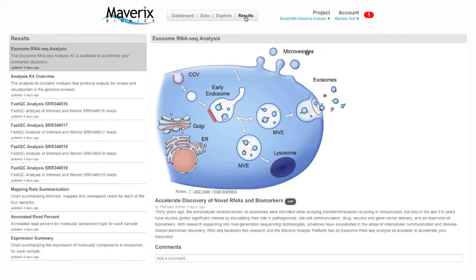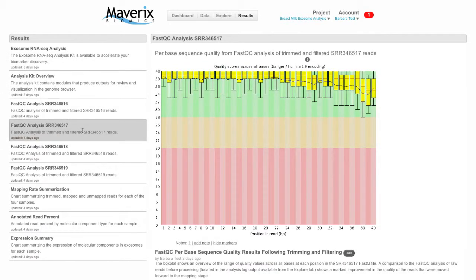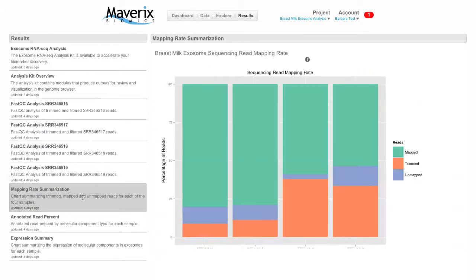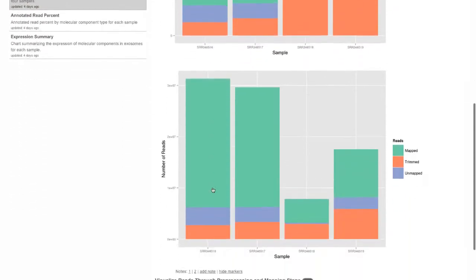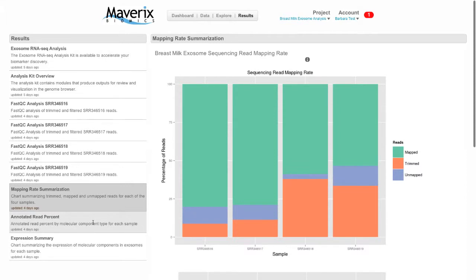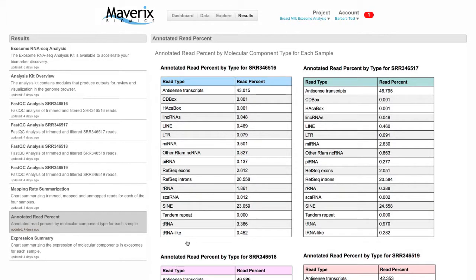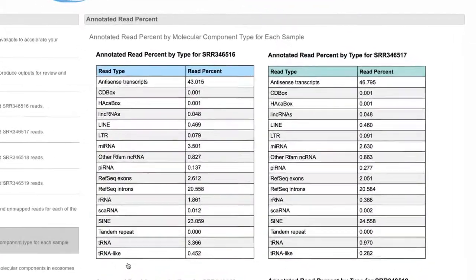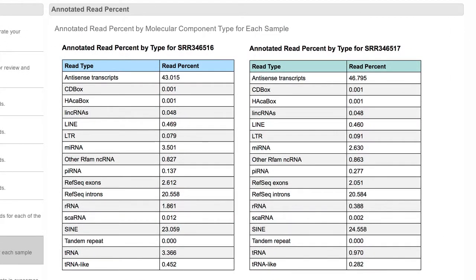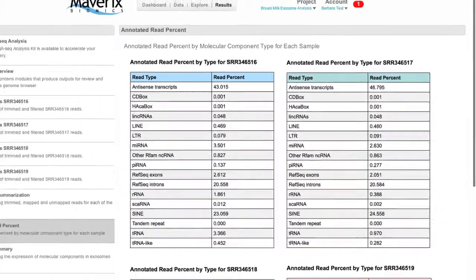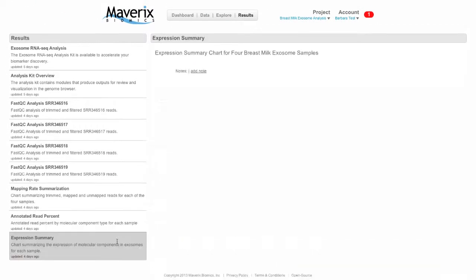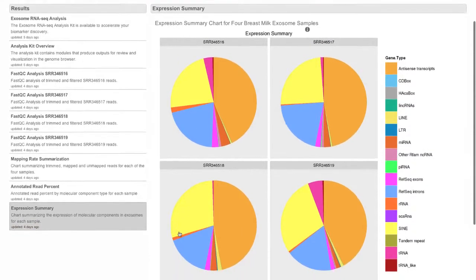Some of the highlighted output from the analysis kit will be promoted to the Results tab. Here we find the final QC analysis results that show the quality of the improved set of reads that were moved into the Bowtie mapping step of the analysis. Your highlighted results are also displayed in plots and bar charts that allow easy visualization and comparison between samples. Here is a tabular display of the expression results from our exosome RNA-seq benchmark dataset showing the percent breakdown of RNAs that mapped to annotated features in the reference genome. This same data is also easily visualized in the expression summary pie charts where the various RNA types are identified for each of the four samples.